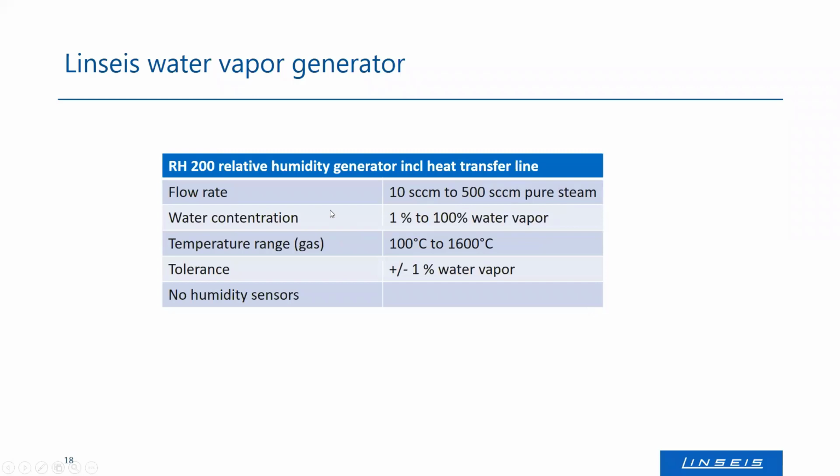It enables us to get water steam concentrations. Please do not mix that up with humidity levels. This is a water steam concentration of 1 to 100% water vapor. It's not humidity, as relative humidity is no longer defined if the boiling point is exceeded. Please keep that in mind.